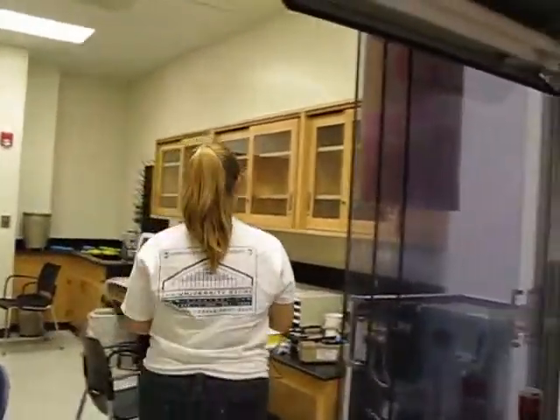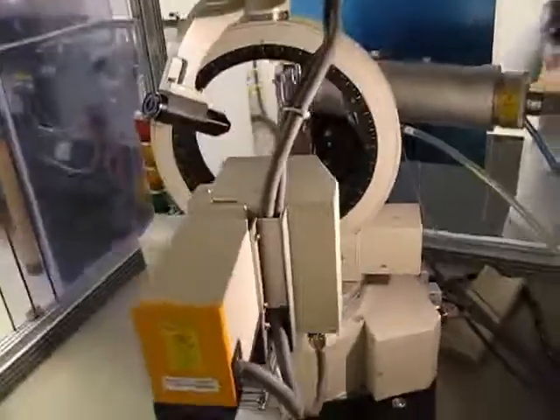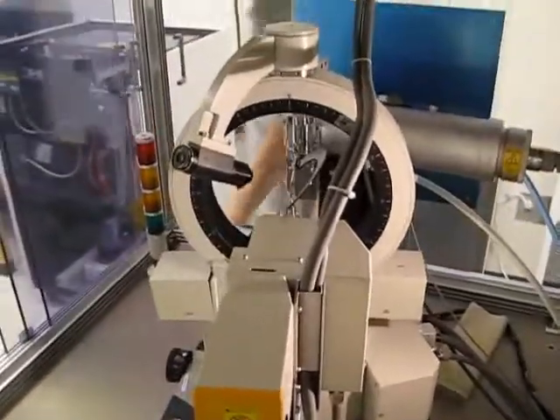And that concludes our lesson today on lubing the diffractometer.